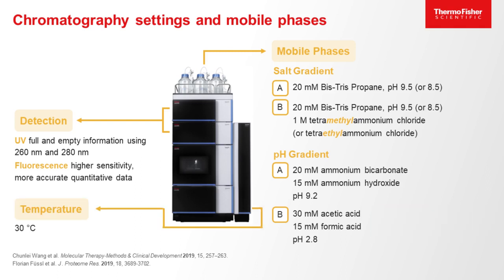For temperature setting, I typically set it at 30 degrees, but you can also explore higher temperatures. But keep in mind the stability of the capsid structure at the temperature and the pressure you are analyzing.